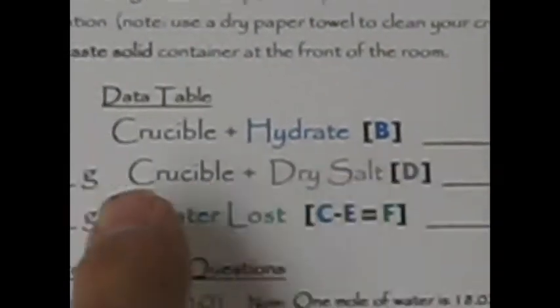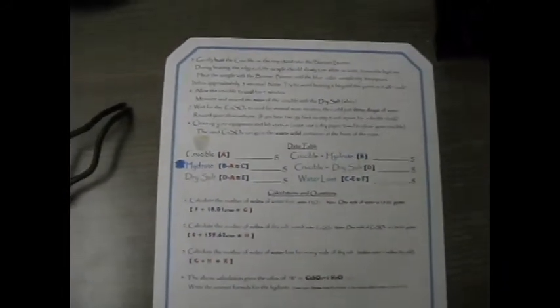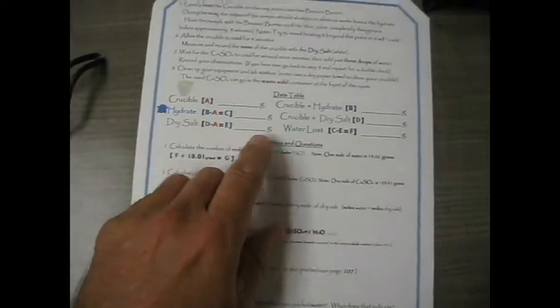For this number, you can subtract your crucible to get just the dry salt. Once you've got the dry salt and you know how much hydrate we put in, that 3 point something grams we put in, then we can find how much water was lost.